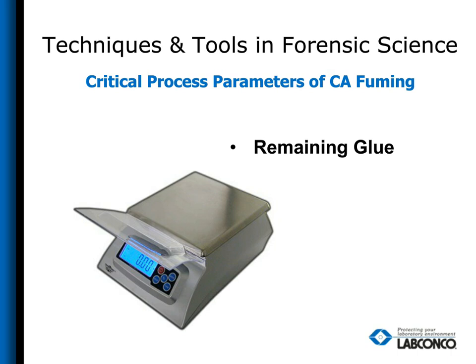Another issue is the understanding of the amount of glue you need, which is variable upon the size of the chamber you're using. But to establish that correct amount, so we're not using extra glue, which leads to other problems of overfuming or underfuming later on in this process, we recommend measuring your glue prior to use during the performance checking, and then measuring the tin at the end. And we found the optimum amount of glue left over is around 10%. So if you take that remaining amount, divide it by the initial amount, you should be coming up with about 10% left over.